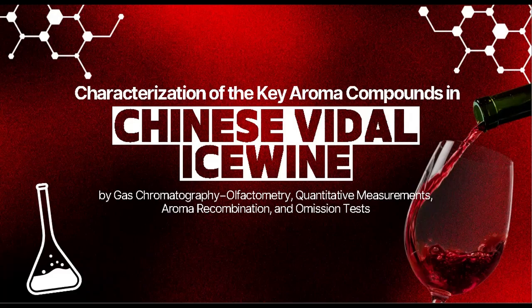Greetings. We are from Group 5, and today we're going to talk about characterizations of the key aroma compounds in Chinese Vidal Icewine by using gas chromatography-olfactometry, quantitative measurement, aroma recombination, and omission tests.